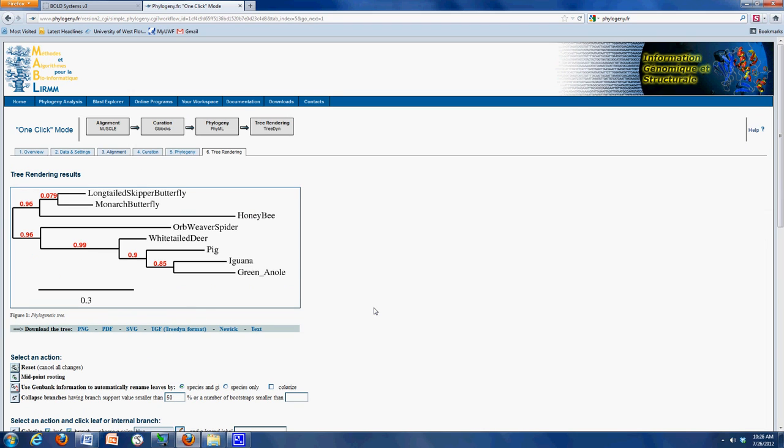Great. This is what we're looking for. It actually worked this time, and hopefully it will work when you do it as well. If it doesn't, certainly email me and we'll try to troubleshoot that problem. So this is the phylogenetic tree.